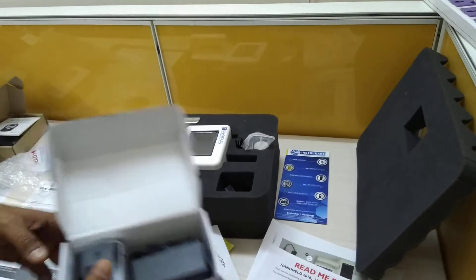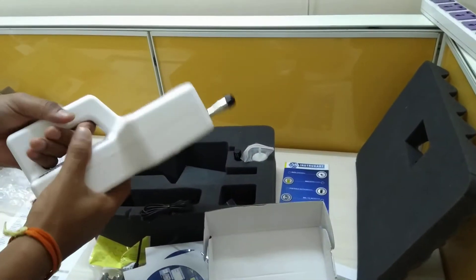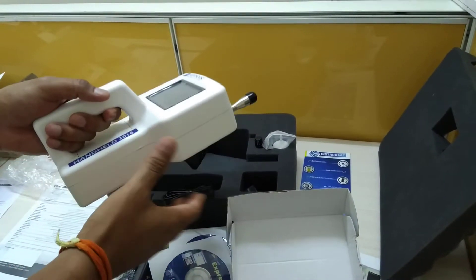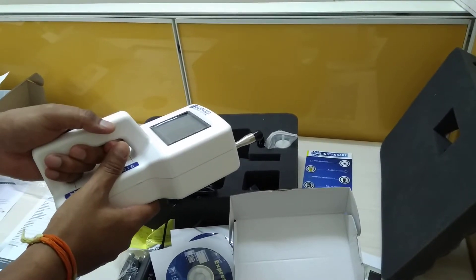These instruments are primarily used for cleanroom validations and meet the latest compliance standards used for validating cleanrooms.